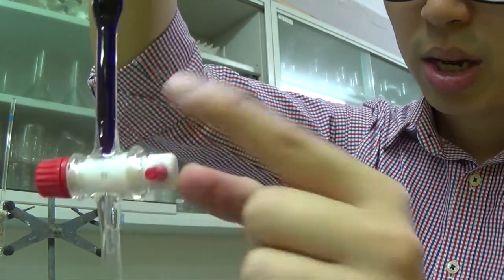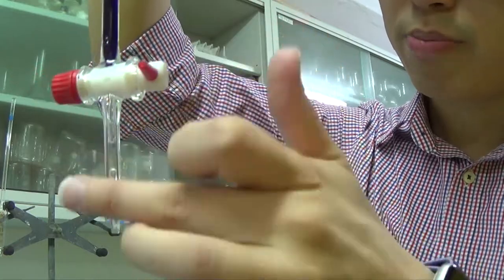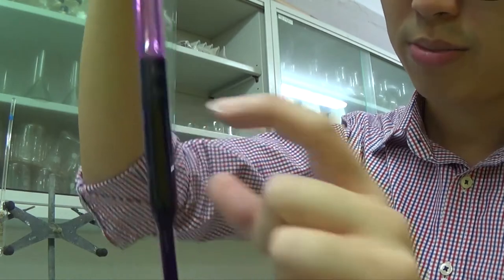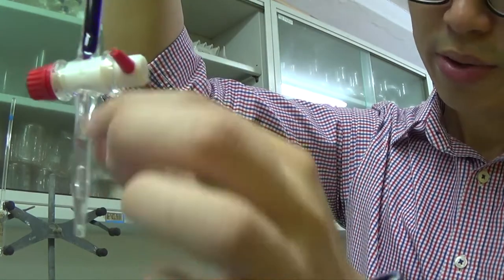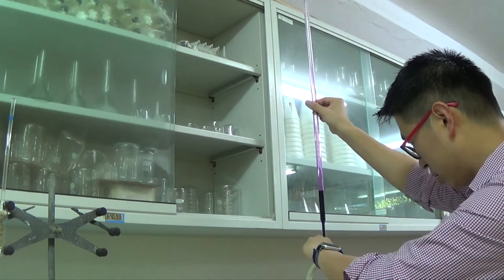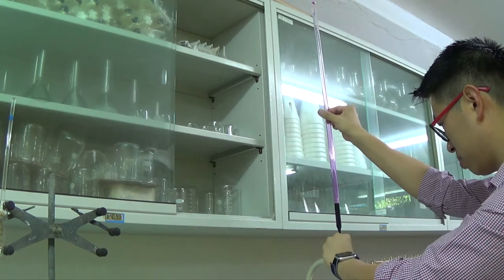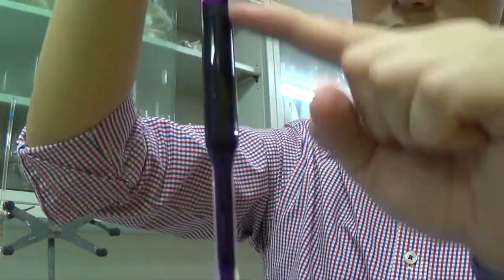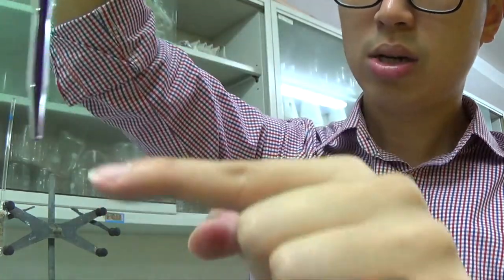But remember that what you see here is the purple bit. So when you record the volume, it's not that accurate because this has not been filled with the purple solution. So before I start my experiment, in fact now, even when I fill in just a little bit, I really must open the tap into the sink so that it can get rid of whatever water is left in here. So that's what I'm going to do here. Pour it down the sink. As you can see now, the bottom bit is filled with the solution that we want to fill it in, and that will get rid of the last bit of water that was remaining there. The tap is still closed, so it doesn't drip.